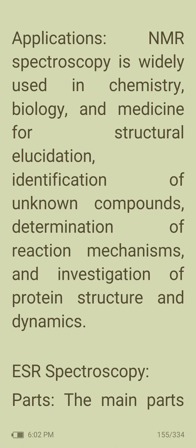NMR spectroscopy is widely used in chemistry, biology, and medicine for structural elucidation, identification of unknown compounds, determination of reaction mechanisms, and investigation of protein structure and dynamics. Next is the electron spin resonance spectroscopy.